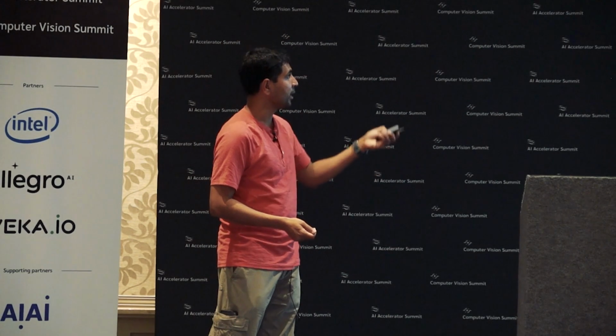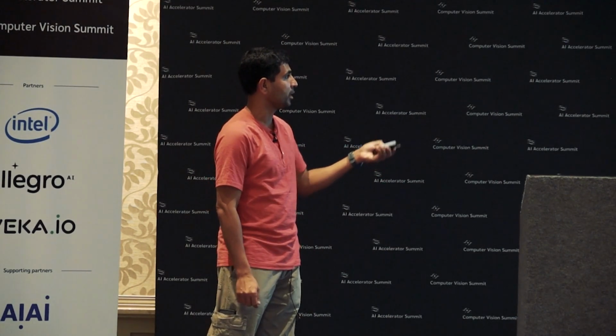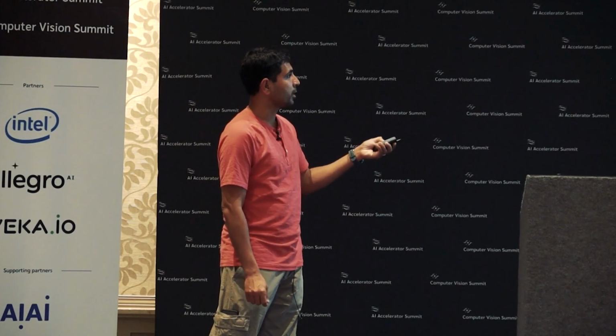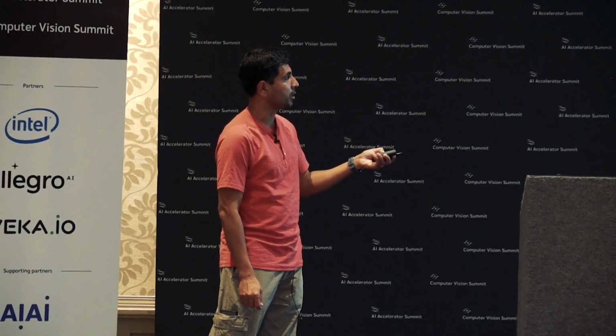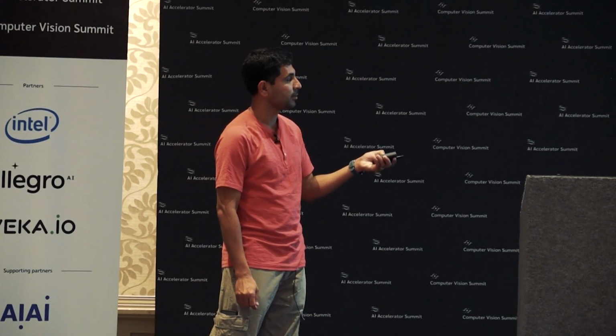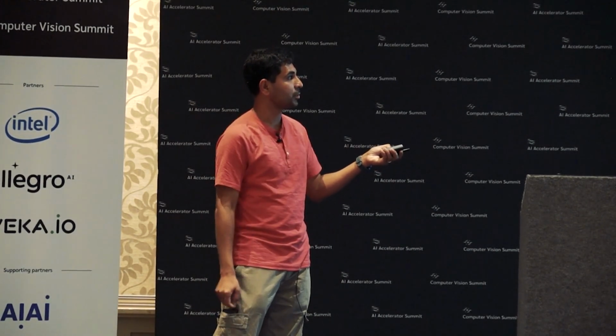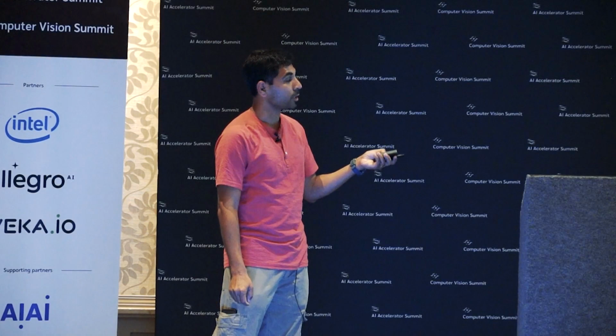So in this pipeline of how you're doing drug development, where you're doing perturbations and so on, the way optical phenotyping helps is that here I'm actually showing you 5 different fluorescent channels that are visualizing 5 different organelles, or rather substructures inside the cell.